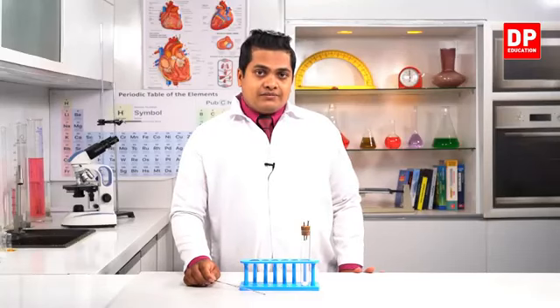So now I have two boiling tubes with the same dimensions. First of all, I'm going to use some amount of iron powder or iron filings. I'm going to insert this iron powder into this boiling tube, my dear children.